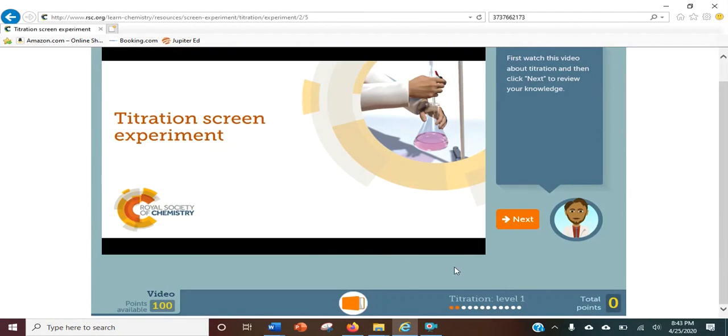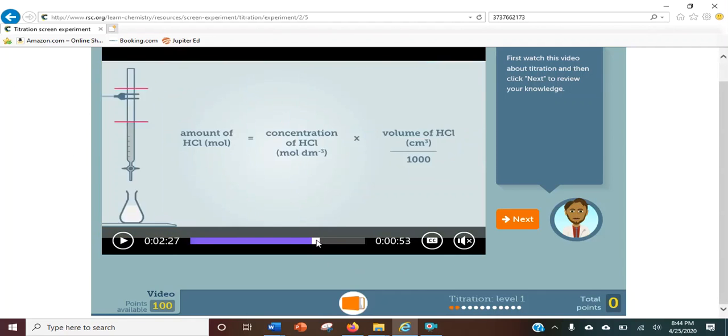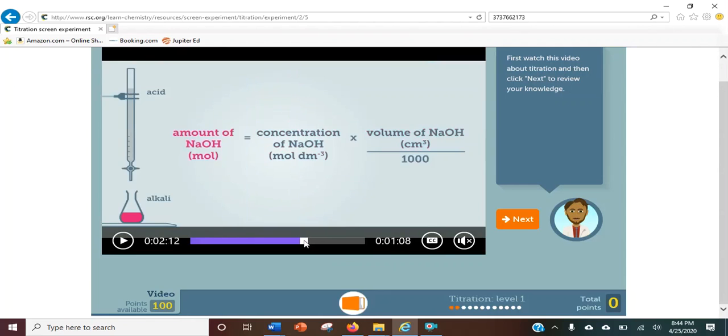So in the video, it talked about a chemical spill. Some acid spilled into the river. You as a scientist want to figure out the concentration of acid in the river. So that is unknown to you. In order to figure it out, you have to do a titration. If you notice from the video, they put the acid in the burette, even though that is the unknown concentration, while the known concentration, they put it in the flask. So this is supposed to be reversed.